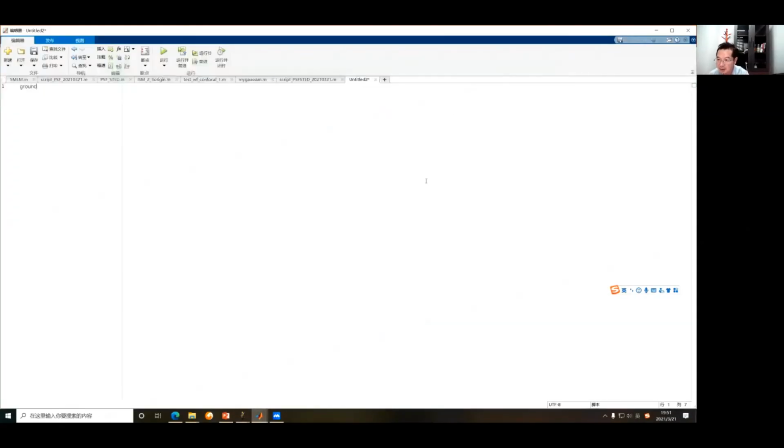My ground truth equals zeros 512, and I will ignite two spots, setting the D to be, let's say, 10.